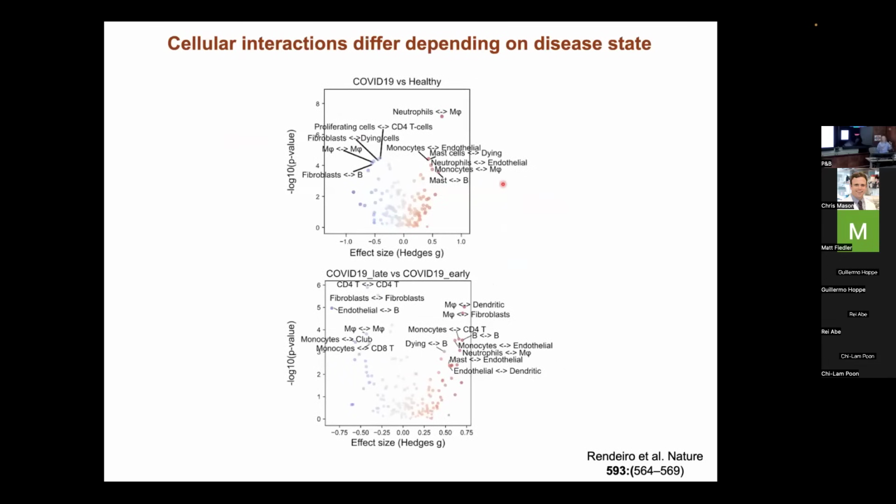So my whole point is that, obviously, there is a multitude of these different emerging spatial technologies. The first one I was talking about that we've been working on, NanoString, can do it at the RNA level. Basically, you can tag RNAs or proteins with this, and using that technique, you can get 1,000, 6,000 different RNA targets, protein level 64 right now, but it'll go into the hundreds ultimately.